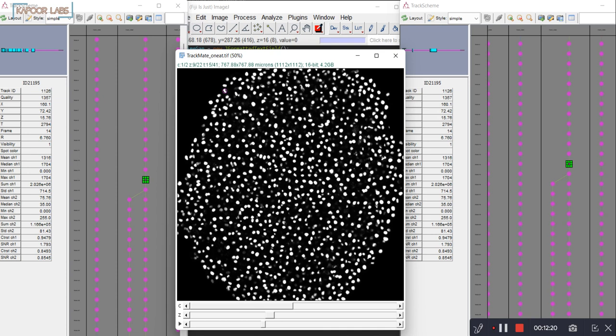So if you have any questions or problems in creating that training data, ask me, and I will be happy to create this kind of trained models for your data set, so you can also get these nice lineage trees in the end. So please try this out, and I will ask my colleagues if it's okay to release this as an example data set. Otherwise, contact me and I will make a training data set for you, so that you can verify these lineage trees between TrackMate and Oneat-corrected TrackMate.